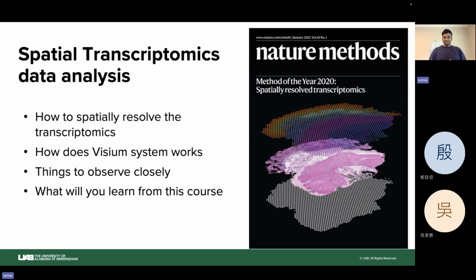There are many steps. When I looked at the data the first time, I didn't understand what was happening in R and why there is an image and all these things. For that reason, I'm explaining the introduction part today. Also, at the end of this, I can show you a demo in R using a single sample. Next session, I'm going to introduce cell types, what the spatial cell types are, and the different techniques for identifying these cell types.